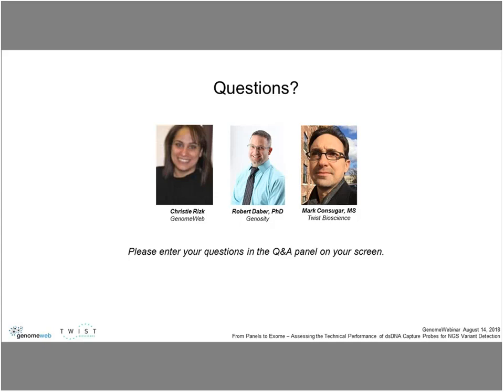Great. And Bob, are your capture probes double-stranded for both the whole exome sequencing panels and the targeted panels? I believe that question is probably for Twist, and yes, it's the same. I could speak on their behalf, right? Same design for panels or exome. Mark, do you want to jump in on that? Yes, that is correct. Okay, great.